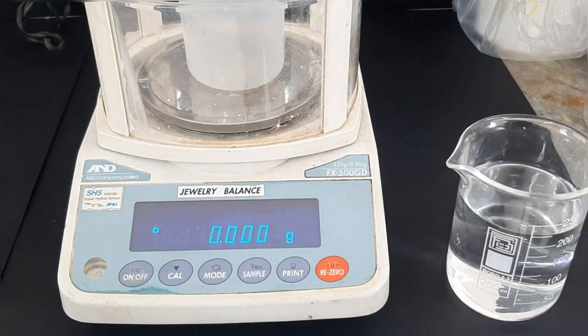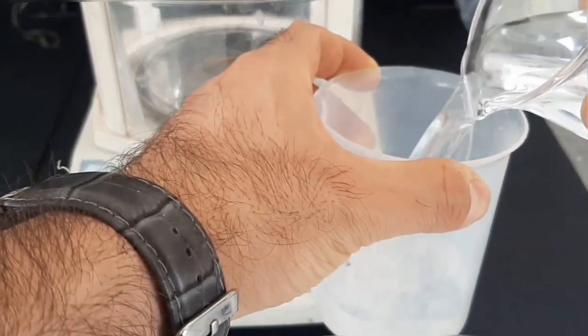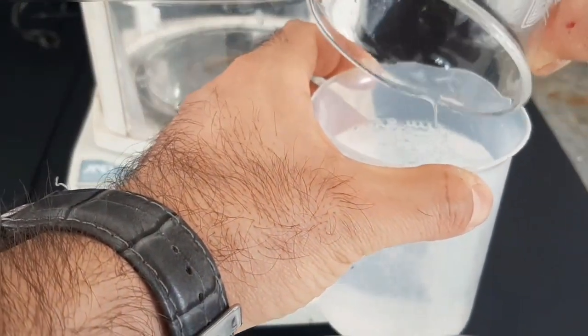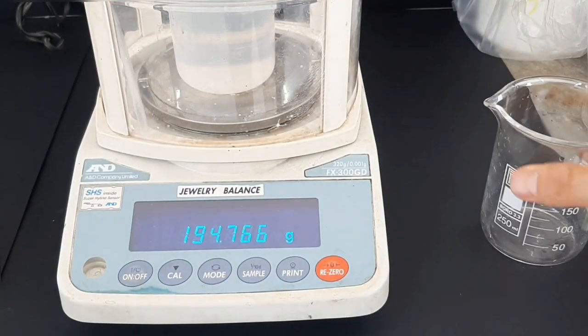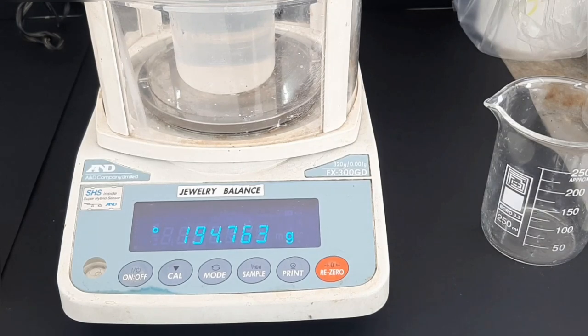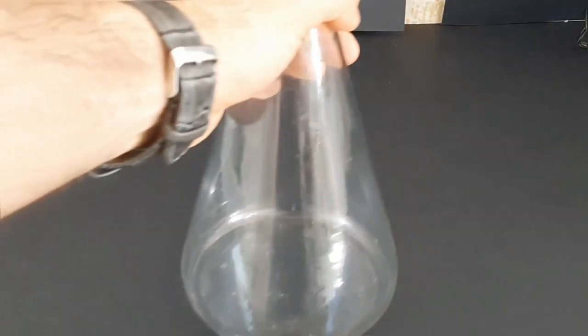This would decrease the yield of the reaction because some of the reagent, which is ethanol, would appear in the product and would be left out of the reaction. So after 2 hours of reaction and adding 1.5 moles more of the reagents, here we are: 194 grams of product, which is crude product, of course.